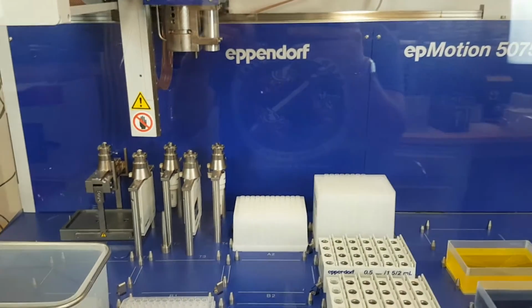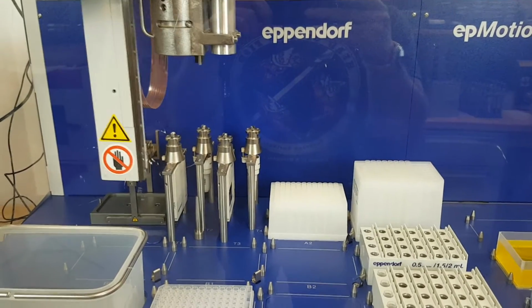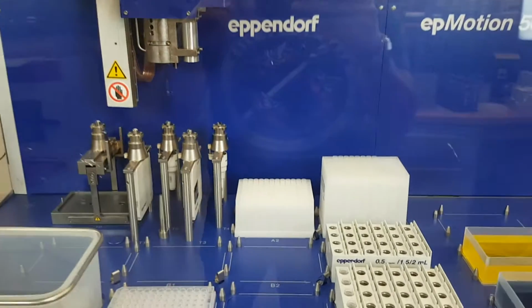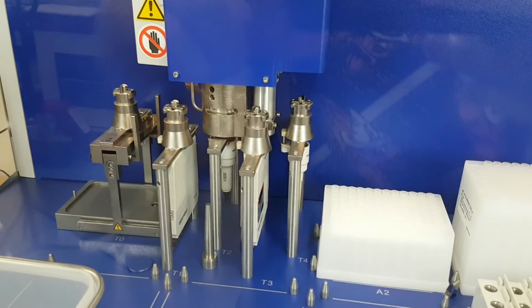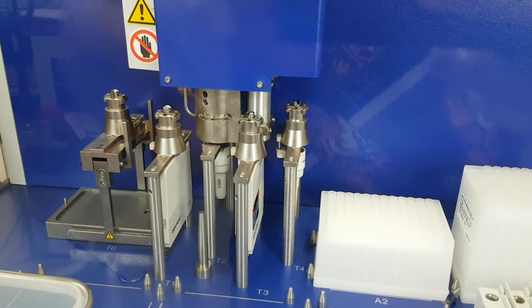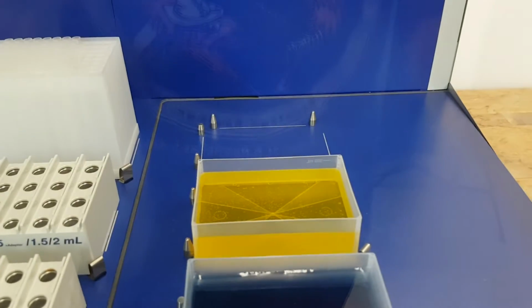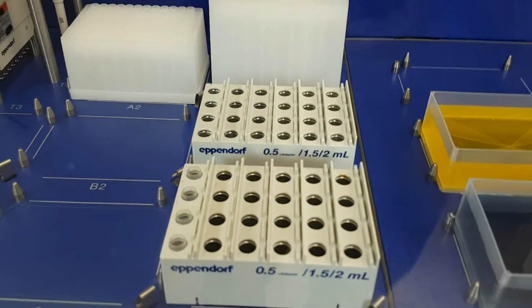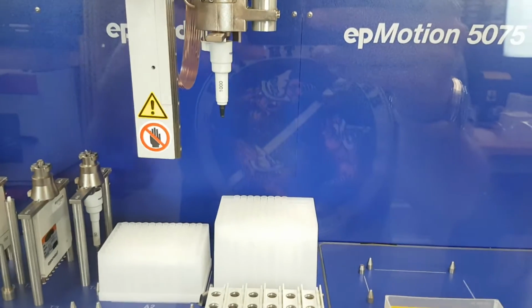So now it's been instructed to wait until the temperature is reached, which it is. So this is now ready to start the demonstration. The first step of the demonstration is the 1000 microliter pipette head is going to be used to pipette some of the yellow liquid into the 4 tubes here. Each one is going to get an equal amount of yellow water.